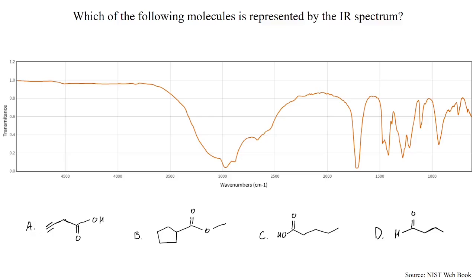Okay. So remember once again, when we're analyzing the IR spectra, we want to analyze anything past 1500. Okay. Starting with the first peak right here, this is a carbonyl peak, which is roughly around 1700. If you look at the very bottom of the IR correlation table, that really isn't helpful because all of these have a carbonyl group in them, so that won't be useful. Look at this very big thing, right?